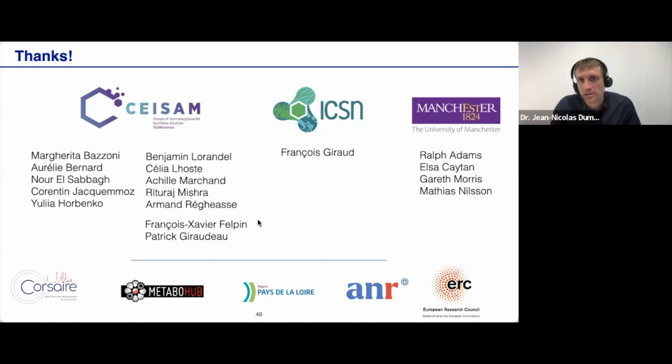Part of the answer is also spectrometer availability and the willingness of your NMR platform to let a chemical reaction run and flow in expensive instrumentation in the absence of someone around to look at it. I guess in principle one can do it. In practice, we do tend to focus our monitoring applications on things that fit within a few-hour, single-day run.